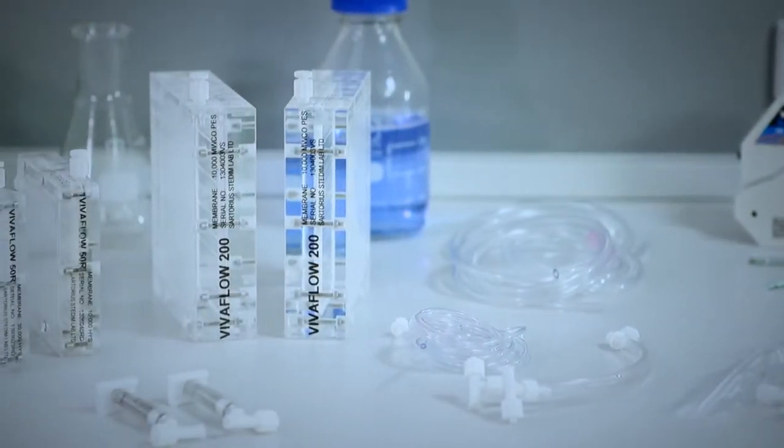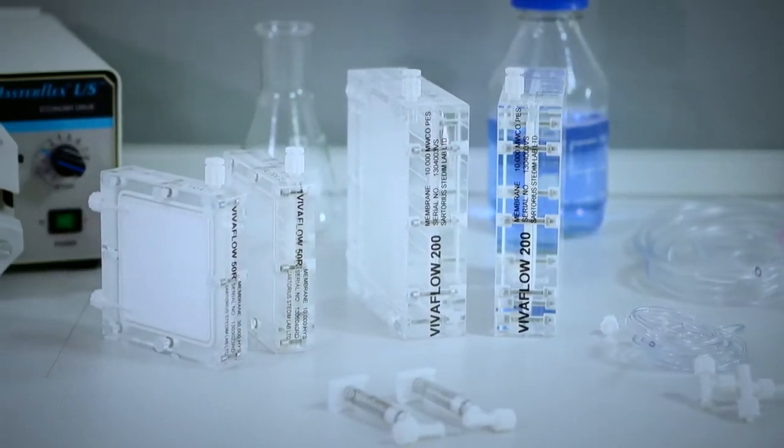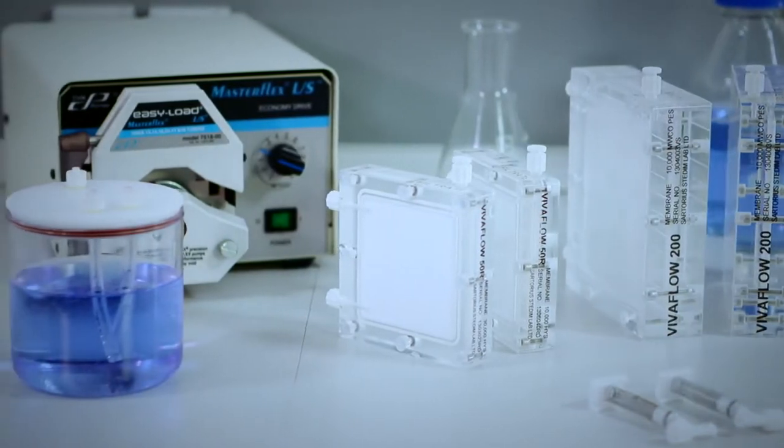VivaFlow 200 units are easy to use laboratory cross flow devices and have been specially designed for fast concentration of samples with initial volumes of up to 5 liters.